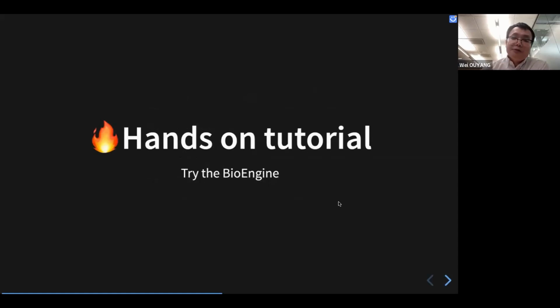So let's move on to the hands-on tutorial. This is going to be, you will do it with Jeremy. Yeah, so does everyone get notebooks or? Yeah, and also the slides.